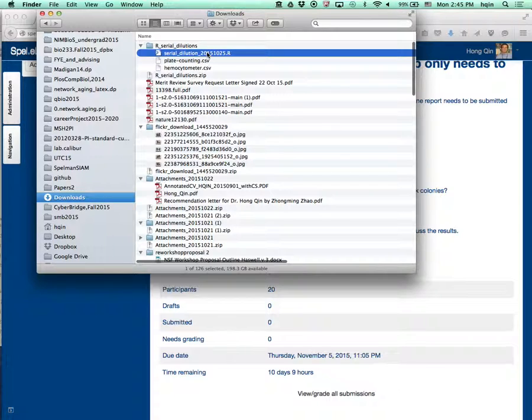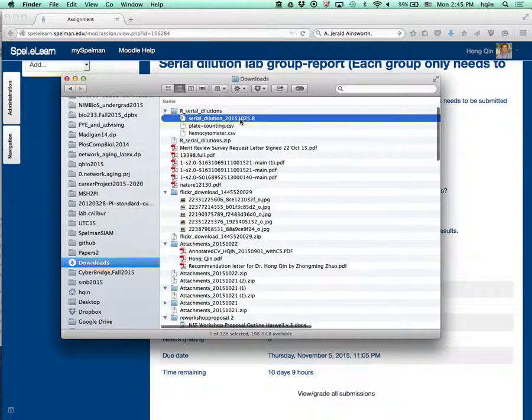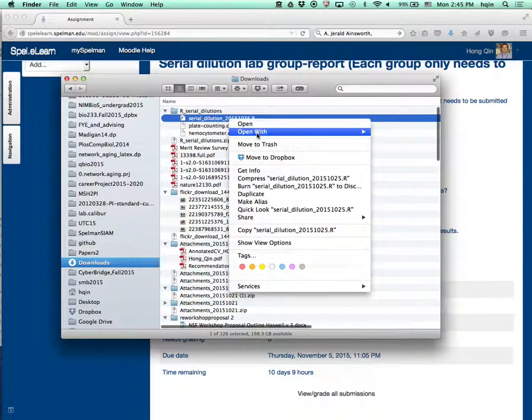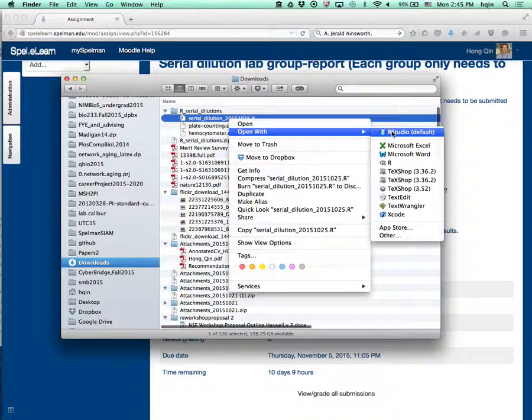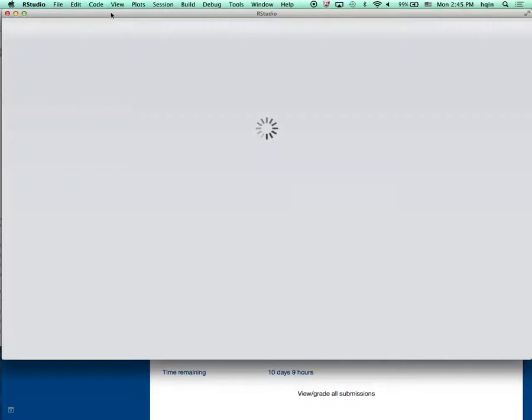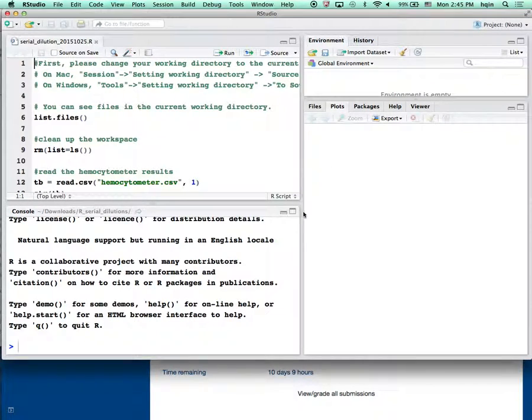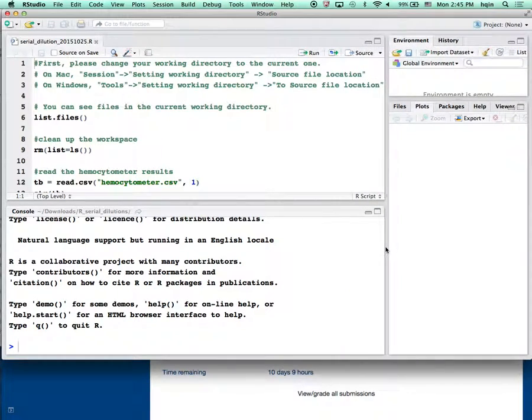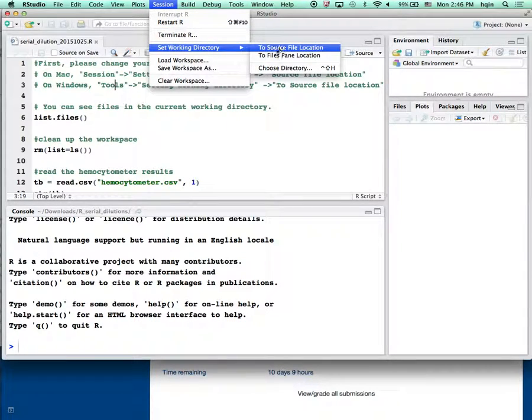Once you extract everything, you want to make sure to use RStudio to open the R code. In this case I'm going to open the R code called 'serial dilution'. I'm right-clicking and opening with RStudio. Once you have the file open in RStudio, you first need to make sure RStudio knows where to find the data file.